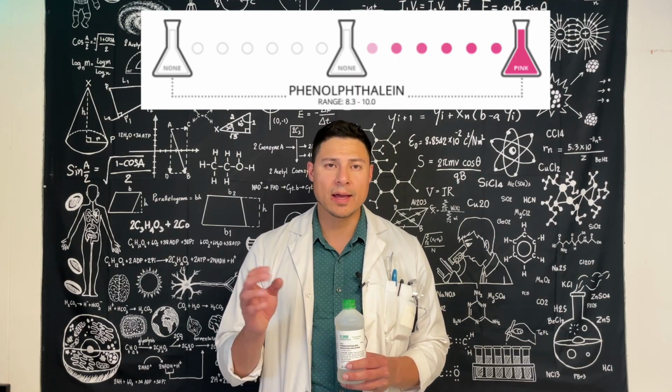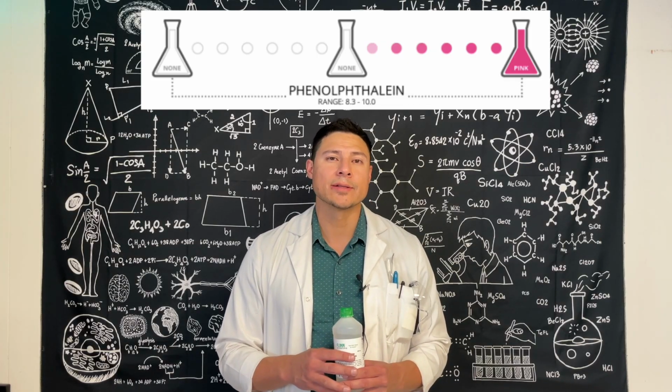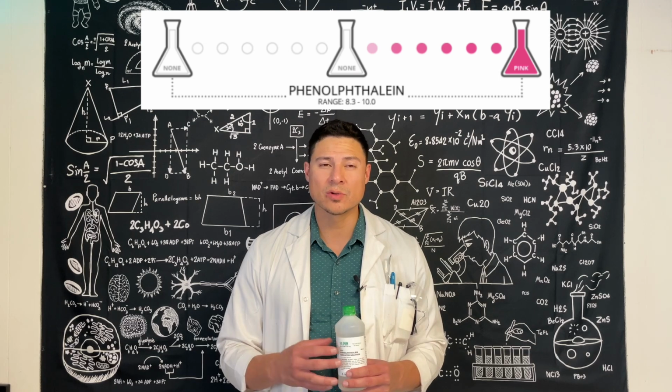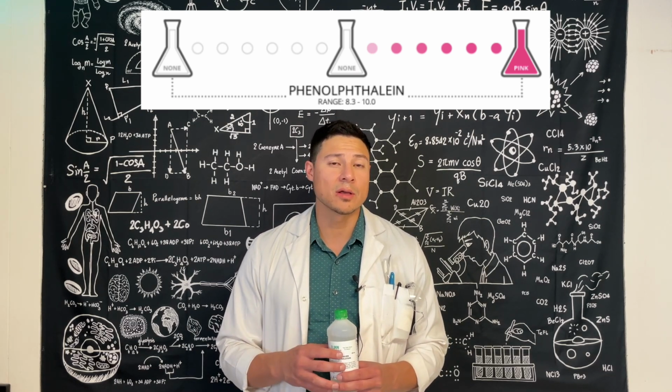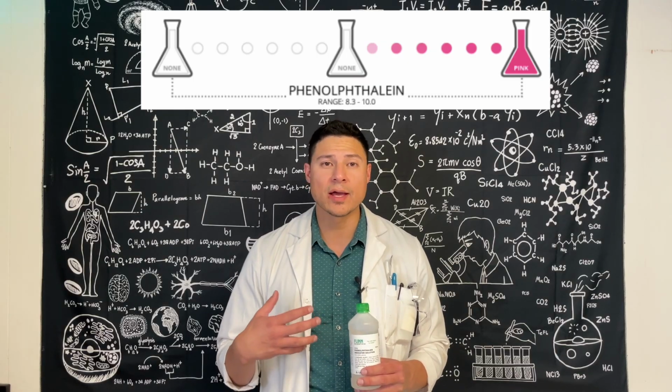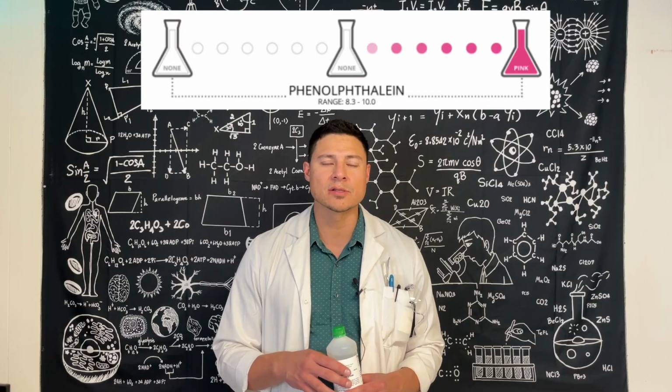And then we will add the metal of interest, which we're going to react with water and see if there is a change. So we're going to try to see if there's a chemical change going on and how fast the reaction might be occurring, which is more reactive, which is least reactive. So we want to find and collect evidence on that.